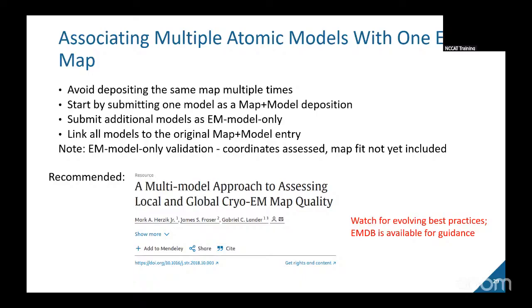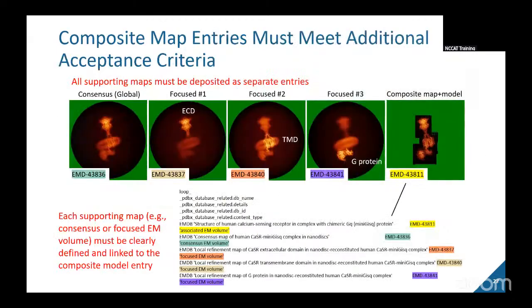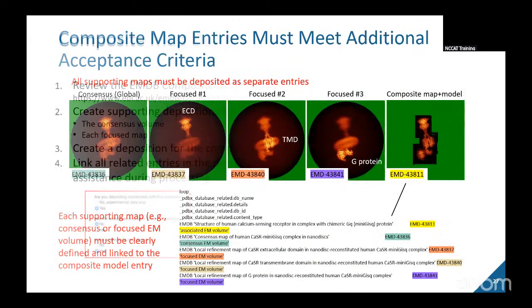With regards to the composite map thing, right now, how it's handled in terms of displaying the connections between those is they're just put in a single list under a layer of EM entries, where it will give all the things that are part of the same thing, and also other ones that are related.